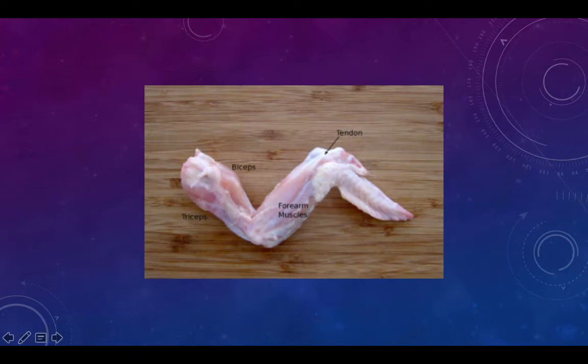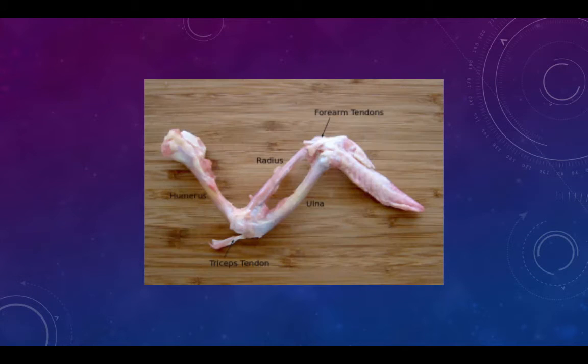When we start digging away, we have the biceps, triceps, forearm muscles, tendons, ligaments — all exactly the same as the human anatomy. If we strip this away again, we have the bones: the radius, the ulna, the humerus. You can see the tendons more clearly now. Obviously, like I said, the hand is the section that's slightly different.